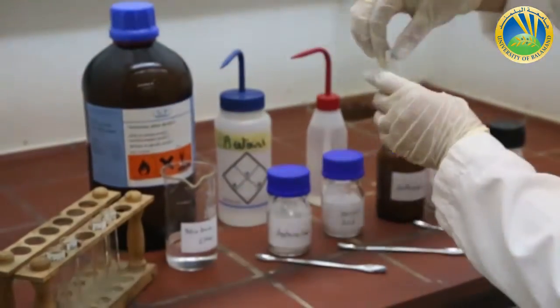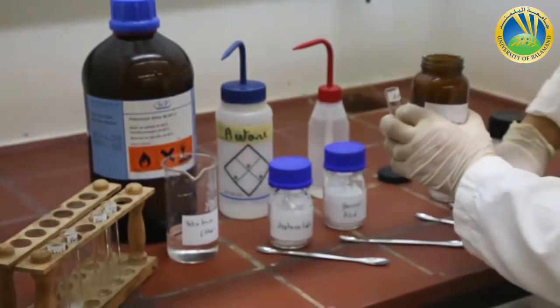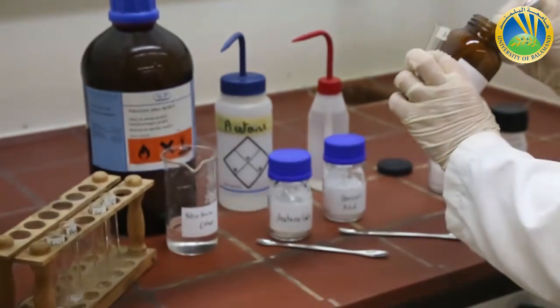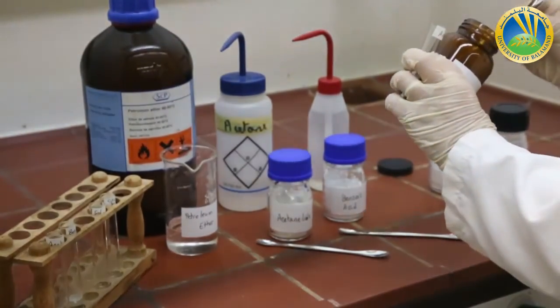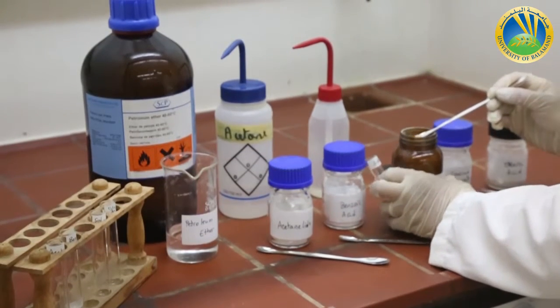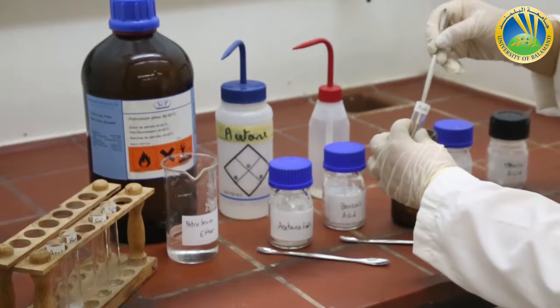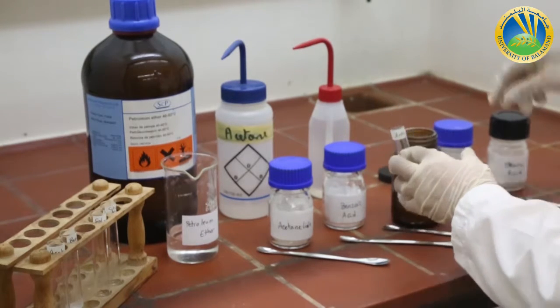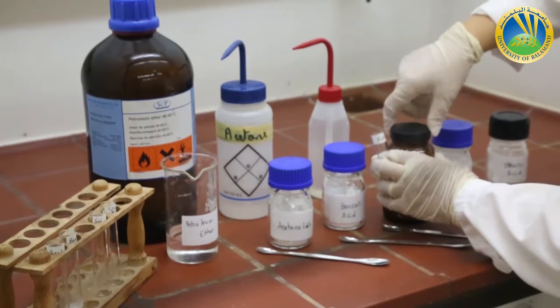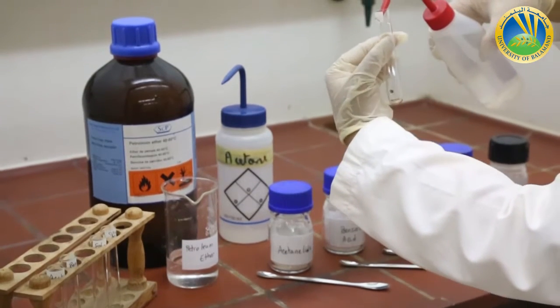The third compound is anthracene. Then a little amount of my solvent.